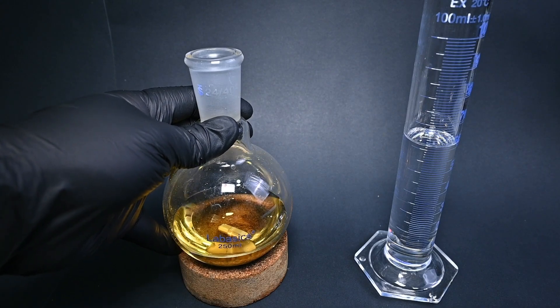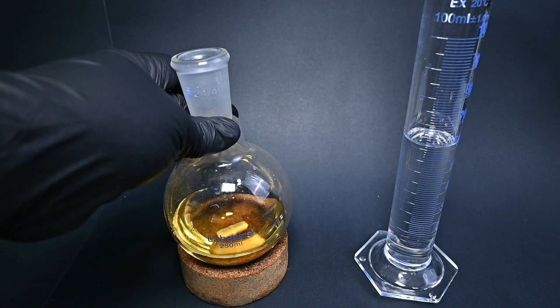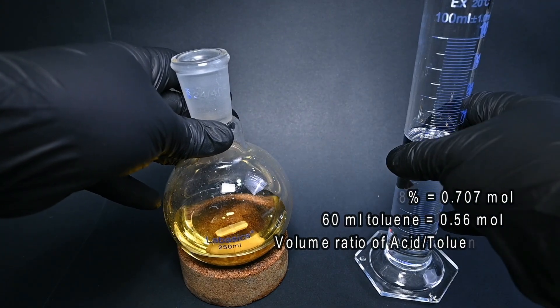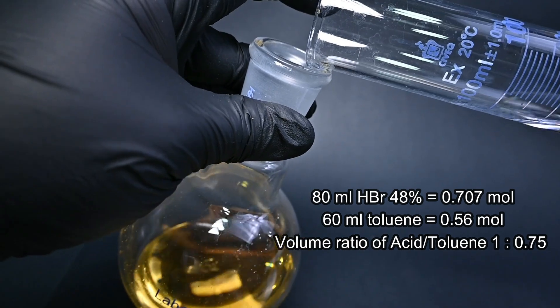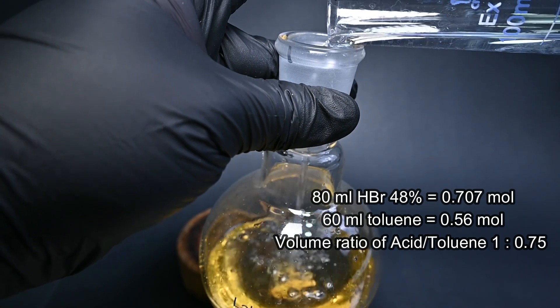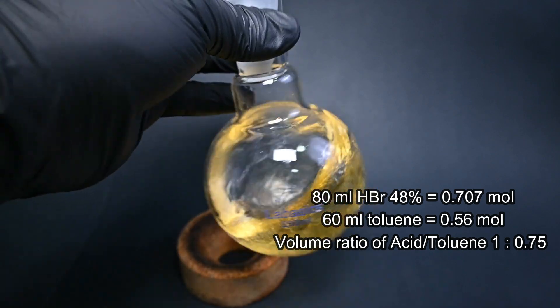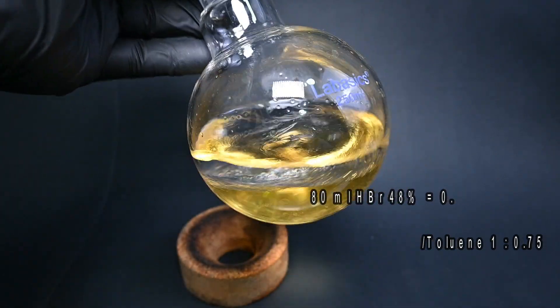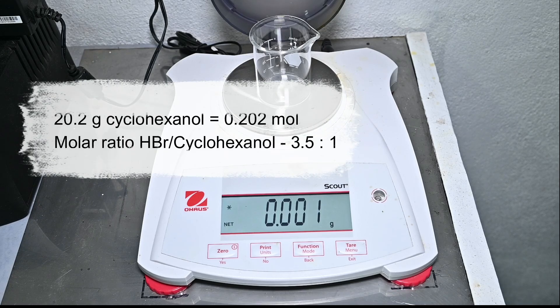First of all, we have in this round-bottom flask 80 ml of azeotropic hydrobromic acid. To this flask we're going to add 60 ml of reagent-grade toluene. Next, we're going to measure 20.2 g of cyclohexanol, which represents a molar ratio of 3.5 to 1 — acid to cyclohexanol.